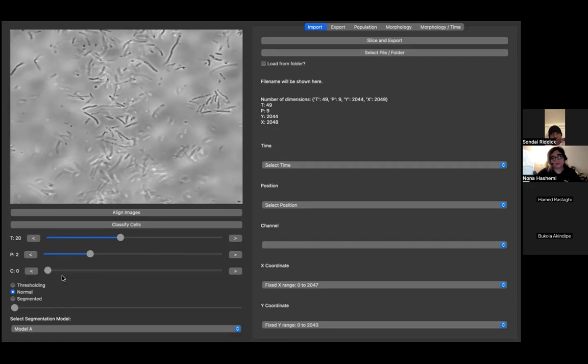So basically, what our tool right now can do is segment your data, so you can visualize the cells very well. You can see each cell at its position, separated from the background and from every other disturbing cells around. So you can see it clearly. It's currently segmenting. This shouldn't take so much time. Just a little more minutes.